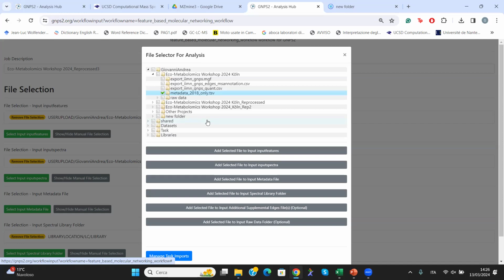That's a great question. I'm gonna introduce it later. So I'm gonna just tell you the minimum requirements for a metadata. The metadata is optional, as we already said, but it's nice to have a way to group your features for your own research purpose.